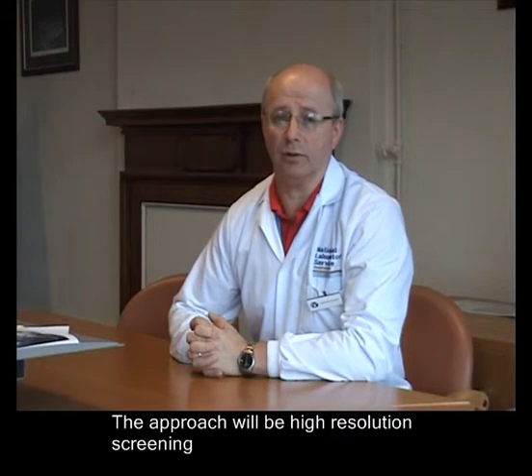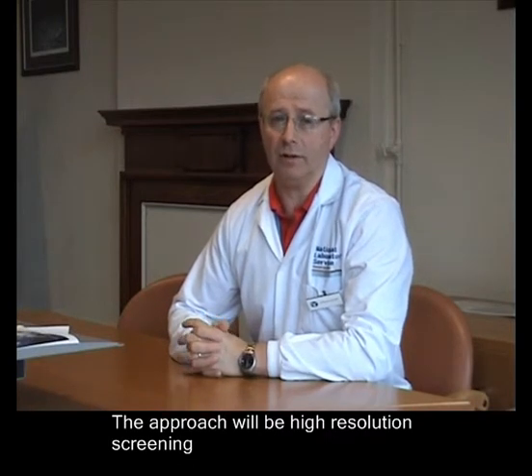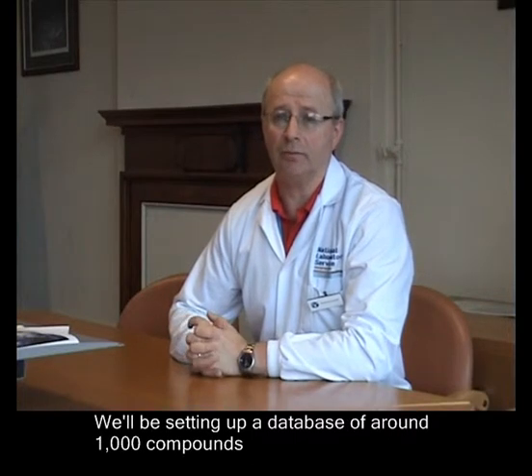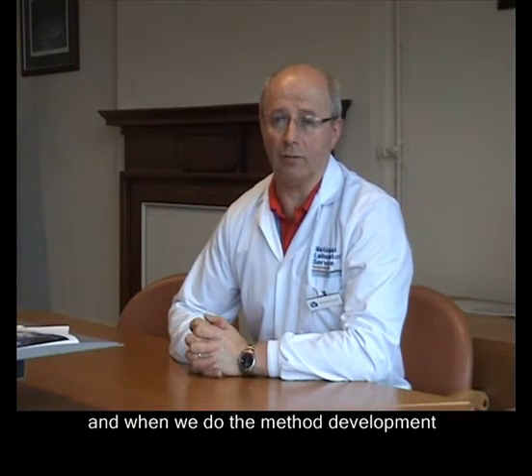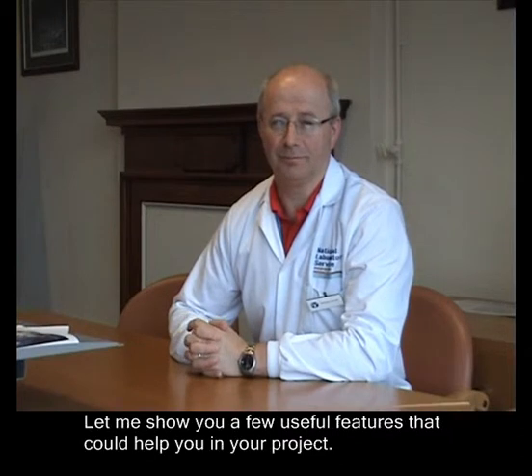The approach will be high-resolution screening. We'll be setting up a database of around 1,000 compounds. And when we do the method development, this method then will be offered to the Environment Agency. Let me show you a few useful features that could help you in your project.